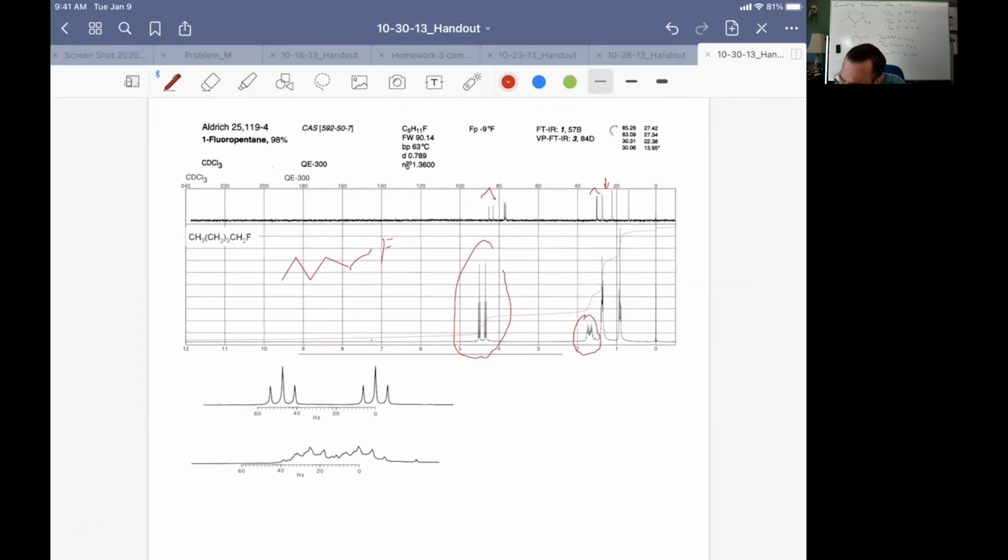You'd see these pairs of lines that look like they go together. So you might get an idea that something is going on with your spectrum. And you might realize there's a fluorine, or perhaps you would have known you had a fluorine in the molecule. And you'd say, oh, wait, that's not 2 triplets. That's a doublet of triplets over here.